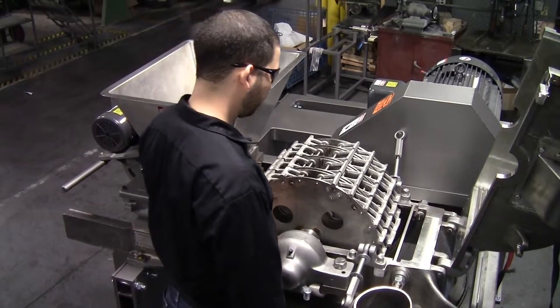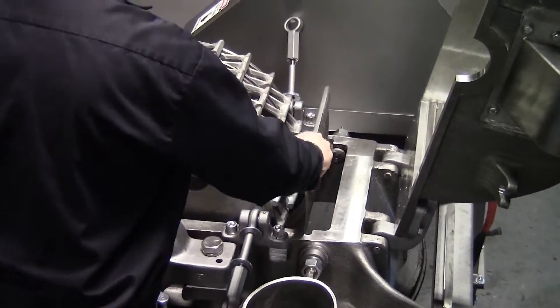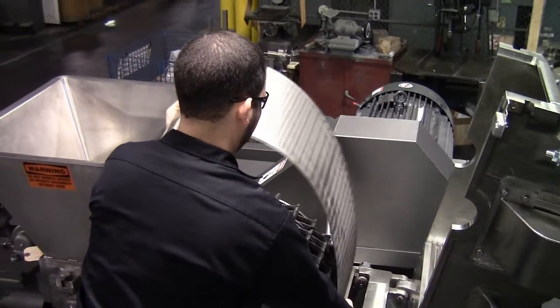Now we can remove the screen assembly from the mill main body, pulling up from one end until the entire screen assembly is free of the machine.